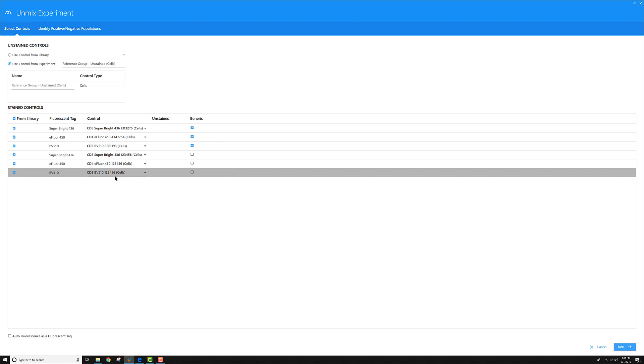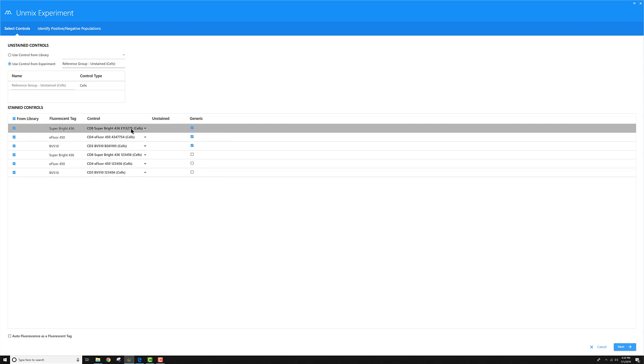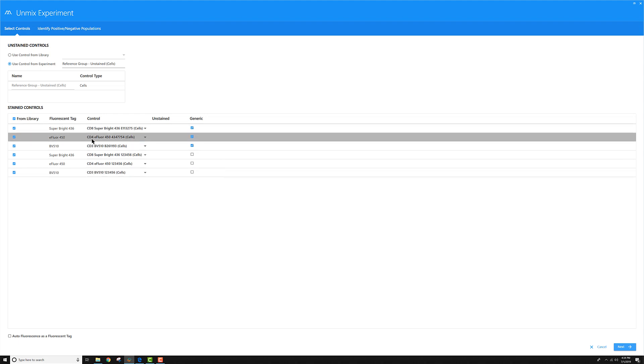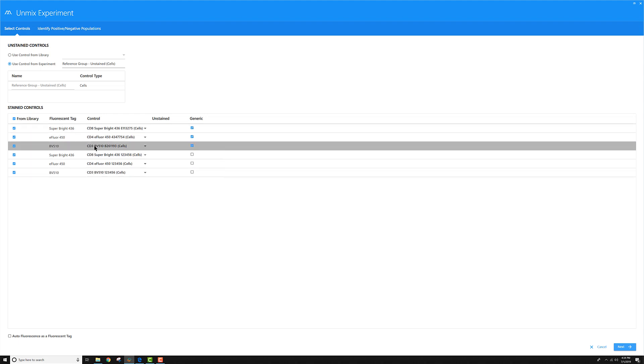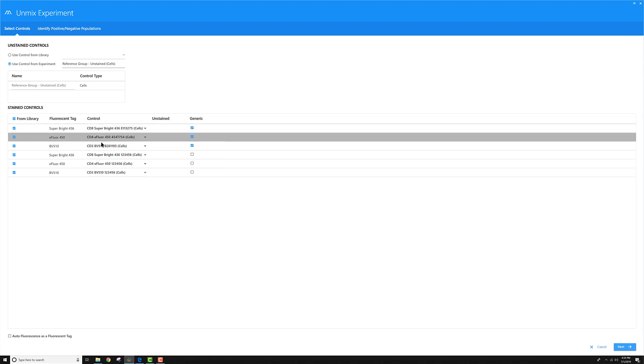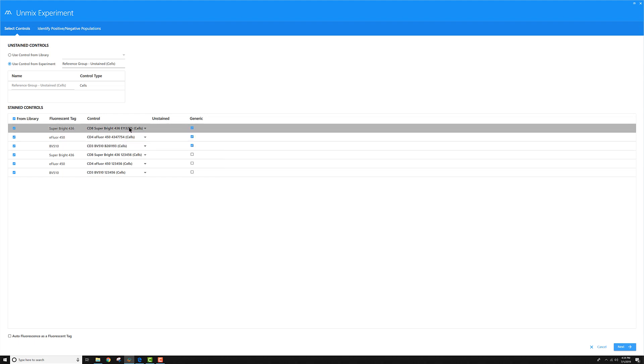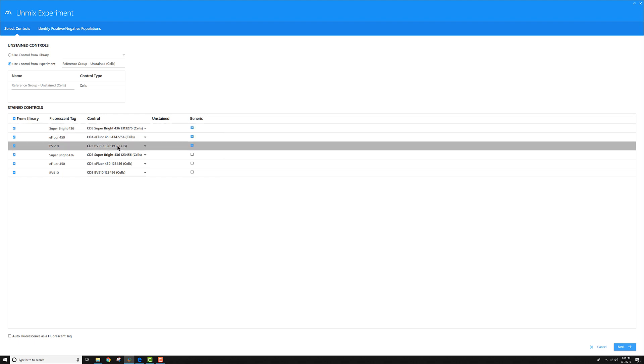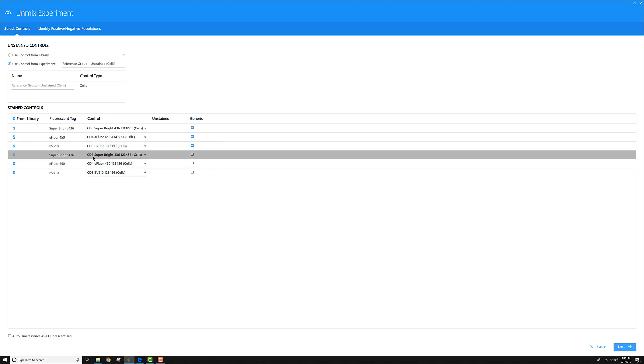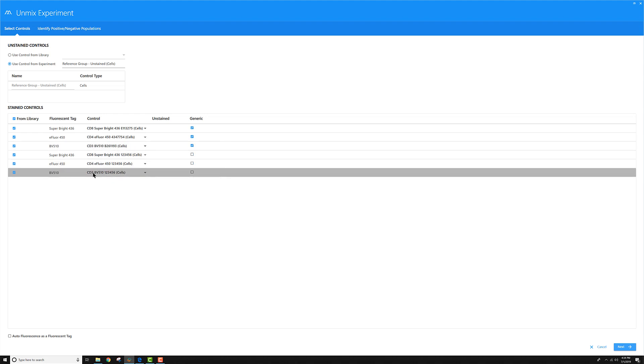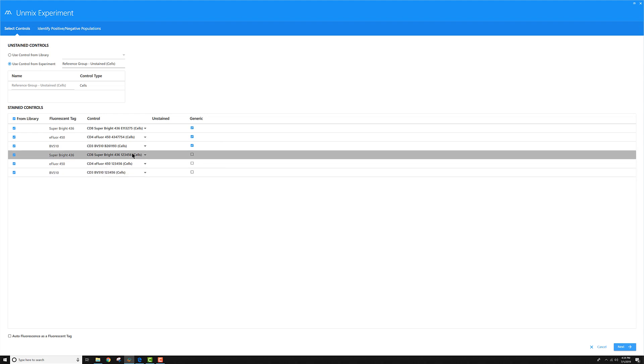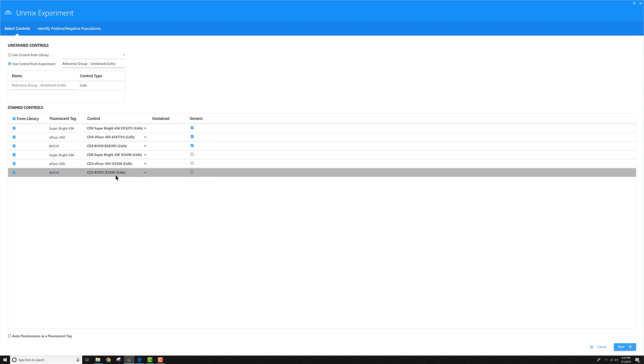For the first multicolor tube, it's going to need the CD8, CD4, and CD3 for these fluorochromes, for these lots, to unmix that group with. Then the second multicolor tube is going to use this other set of CD8, CD4, and CD3 on these fluorochromes for this other lot that I have in my library.